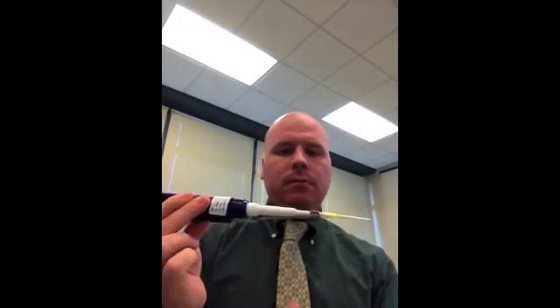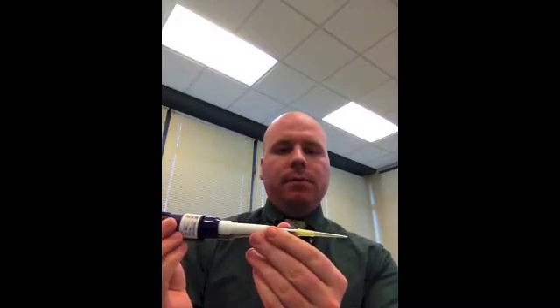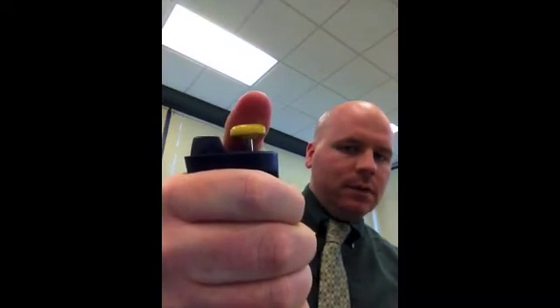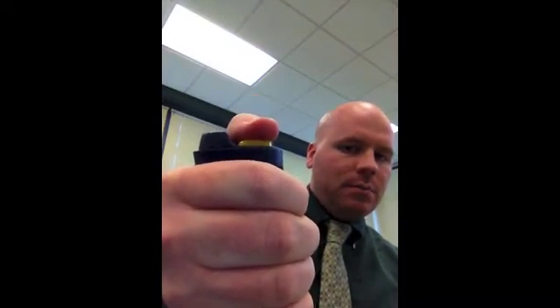So this is a micropipetter that we're going to be using. It sucks in your DNA sample in very small amounts through that little tip right there. So to use this, the plunger is what allows you to suck in material and spit it back out. So with this, when you take in a sample, there's two ways you could press. You could push it until you feel a little bit of resistance, and then you could push it past that resistance point. So if you watch, I'll stop when I feel the resistance, and then I could go past that point.